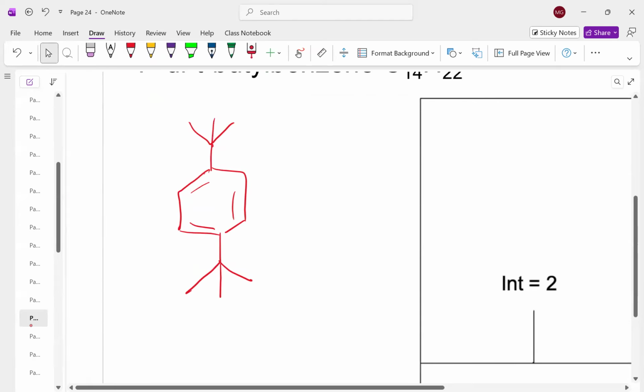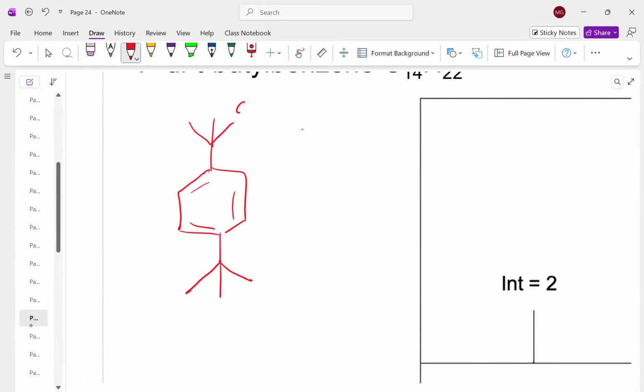And again, before we look at the spectra, let's do some predicting. First of all, how many signals will we see? Well, all 9 of these hydrogens here are equivalent to each other. I'm not going to draw all 9 of them out, but notice that they're all attached to this same quaternary carbon. And we'd say the same thing for the ones on the bottom. All 9 of them are attached to the quaternary carbon. And because this is related by symmetry, these are also A hydrogens.